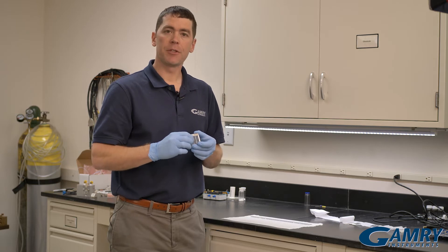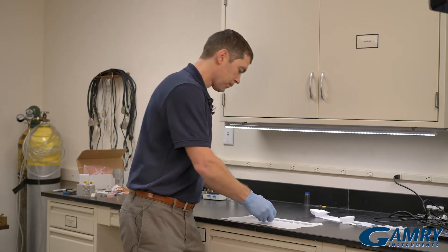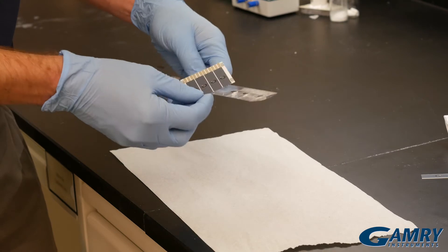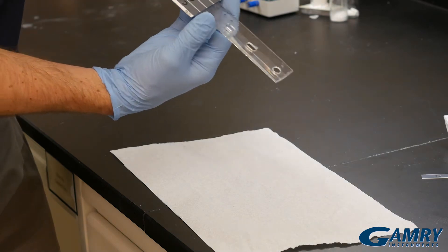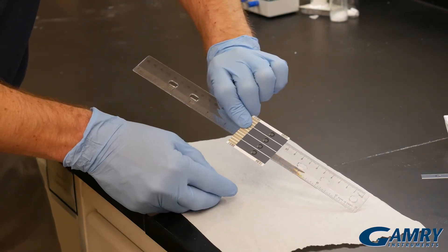They've been scribed in between the electrodes, so it's really easy to snap them apart if you have a nice straight edge to push against. What I found works best is that I take a ruler and put it on the back side of the screen printed electrodes, running it along the scribe line so that it's easy to snap the electrode off.